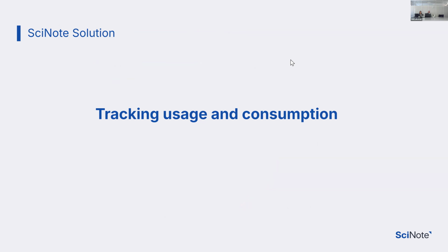So we understand. The questions we often hear are who used what, how much it was used, when it was used, was it restocked? So what's happening with all the samples, all the reagents, chemicals, equipment? What's happening in terms of usage? What's happening in terms of consumption? This is also something that we hear probably the most often in terms of inventories. And those are the questions that people are asking us. And let's dive into the features of SciNote and see how those things can be set up.